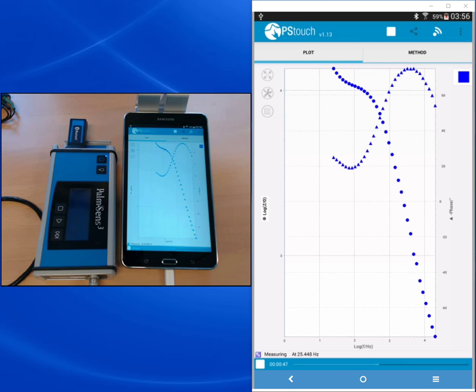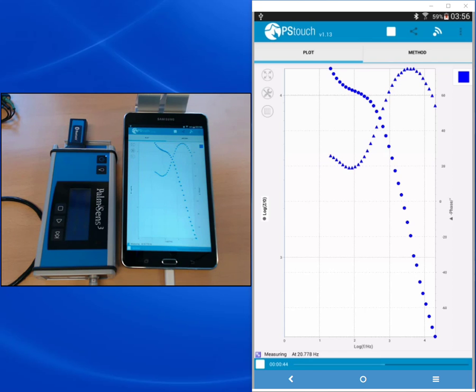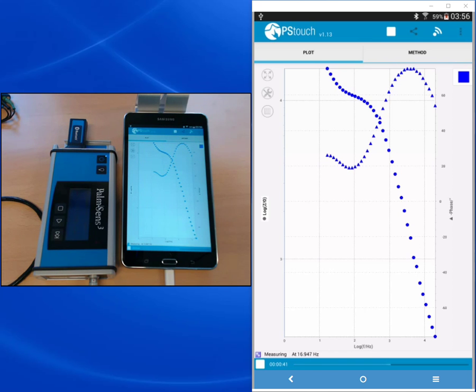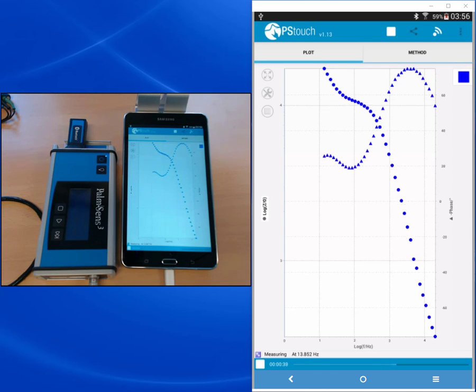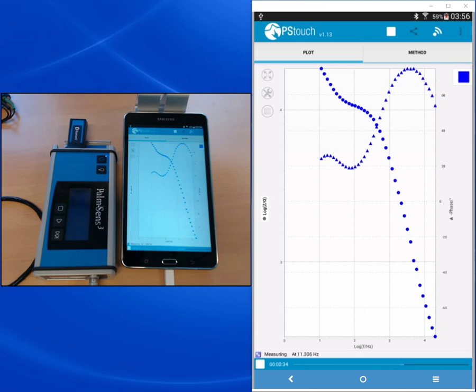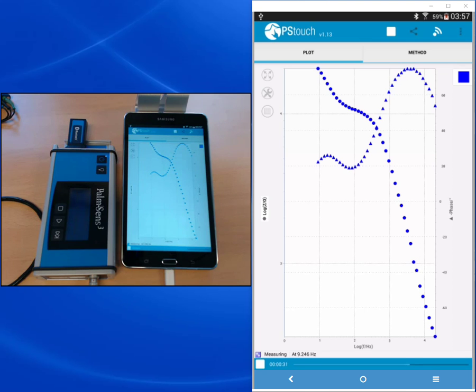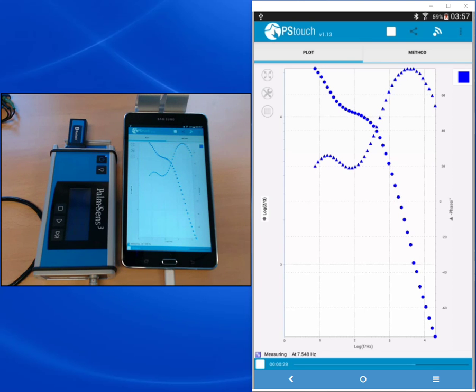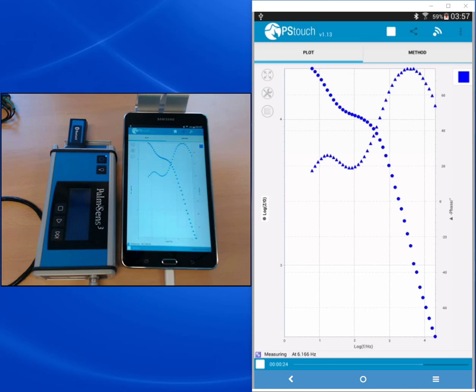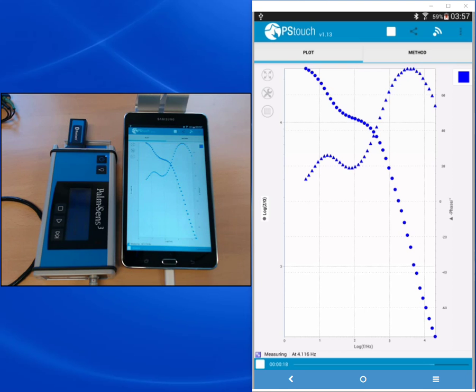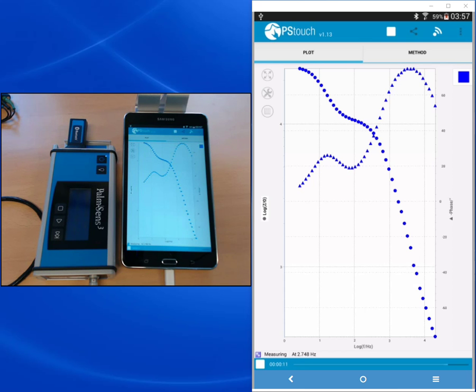And you also can notice that the points are taking longer and longer when the frequency is getting lower and lower. If you want to know at which frequency you are right now, you can see that in the status bar. So above the progress bar you can always follow at which frequency we're measuring right now. So for example, we are now at 3.363 hertz. Now we'll wait until the measurement is finished.